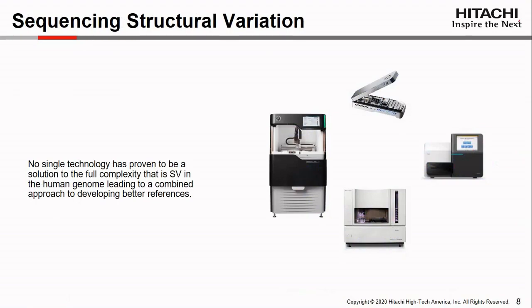The hope is that sequencing could fill in this gap and yield. However, Illumina short-read sequencing technology, while inexpensive and ubiquitous, cannot consistently resolve SV beyond 2 kb due to the fact that the sample prep protocol requires DNA molecules to be sheared to very short lengths in the hundreds of base pairs. Reassembling these very short reads to span breakpoints of large structural variation, and particularly repeated regions, has obvious inherent limitations. Also, despite advances in phase sequencing, the haplotype is often lost in the consensus.